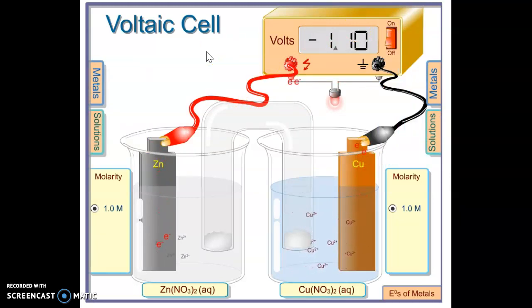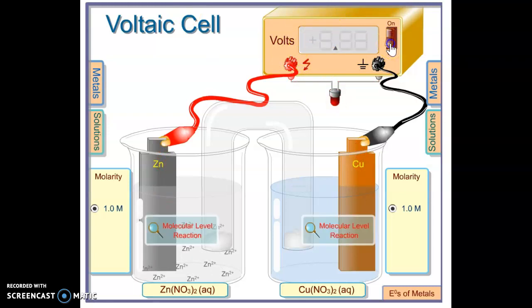Write down your observations. Something that's interesting, if you compare that to when you had the copper on the left and the zinc on the right, what do you notice? Again, those signs are important.